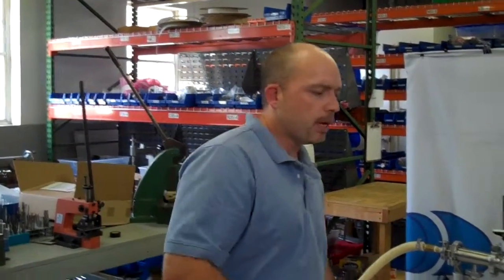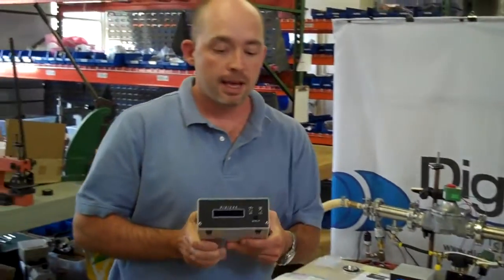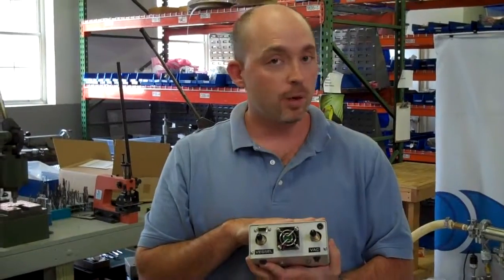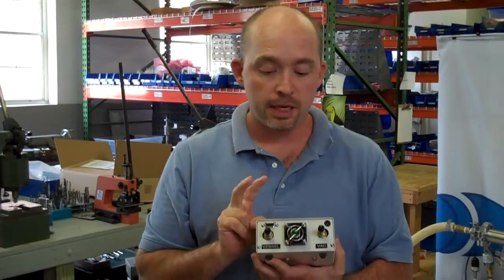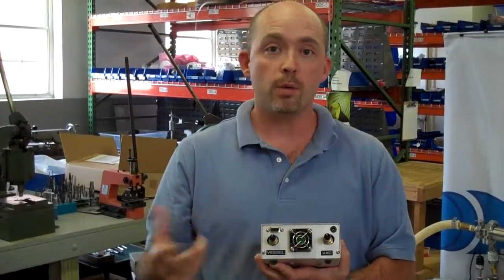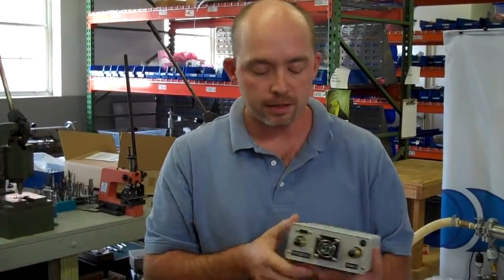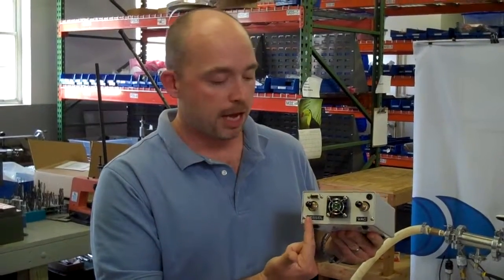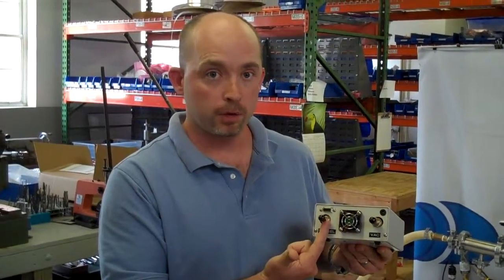When you buy it on the website or the standard product, it's this big brick that looks like this. It has this pretty front with a bunch of switches that are customizable. In the back, it's quite simple. You just have two connections. It works as both an instrument, a measurement instrument, and also as a control mechanism. You hook up your vessel to be controlled to this hose barb, and then you hook up your vacuum pump to this hose barb.